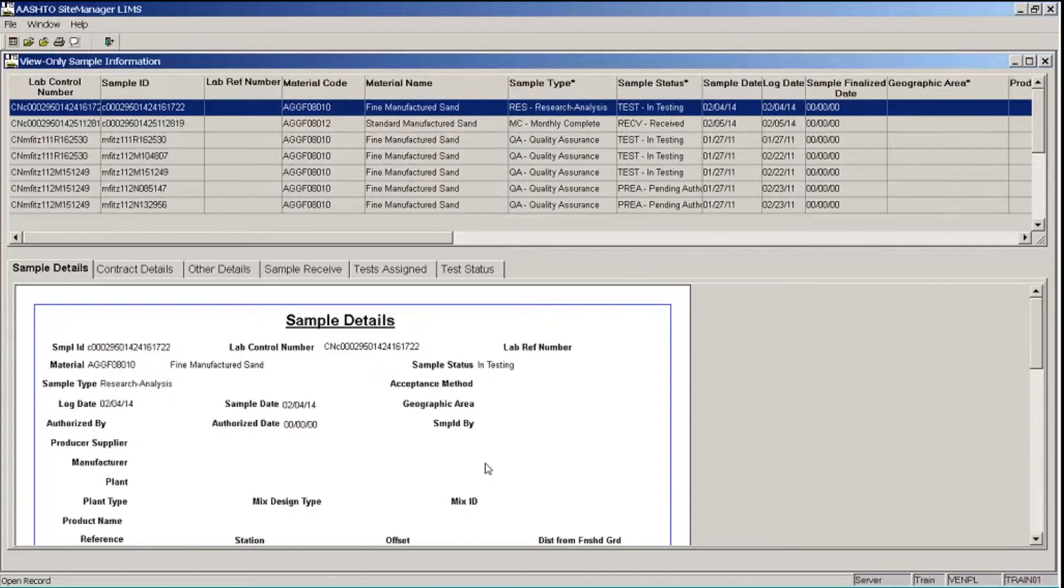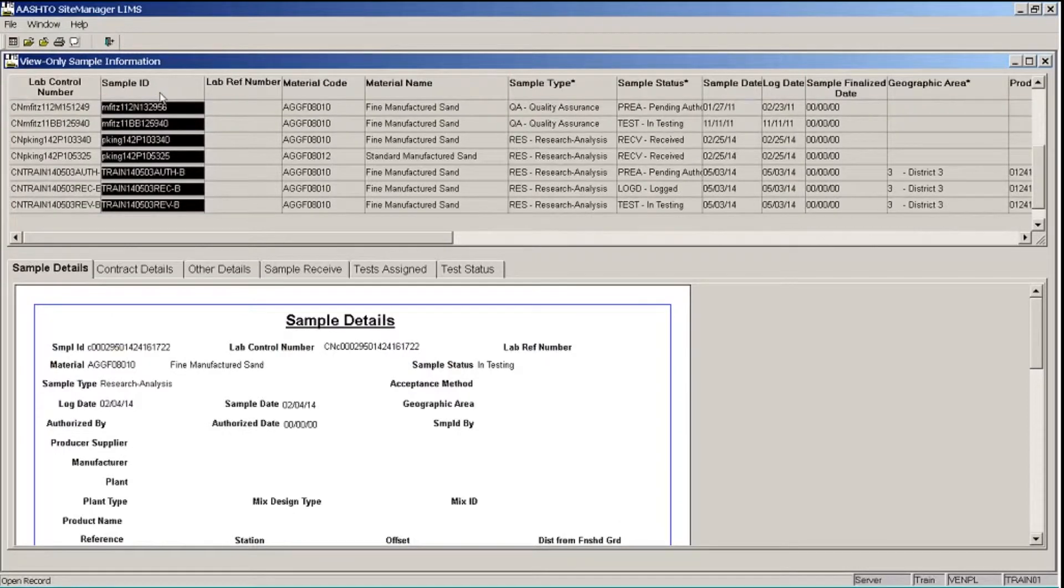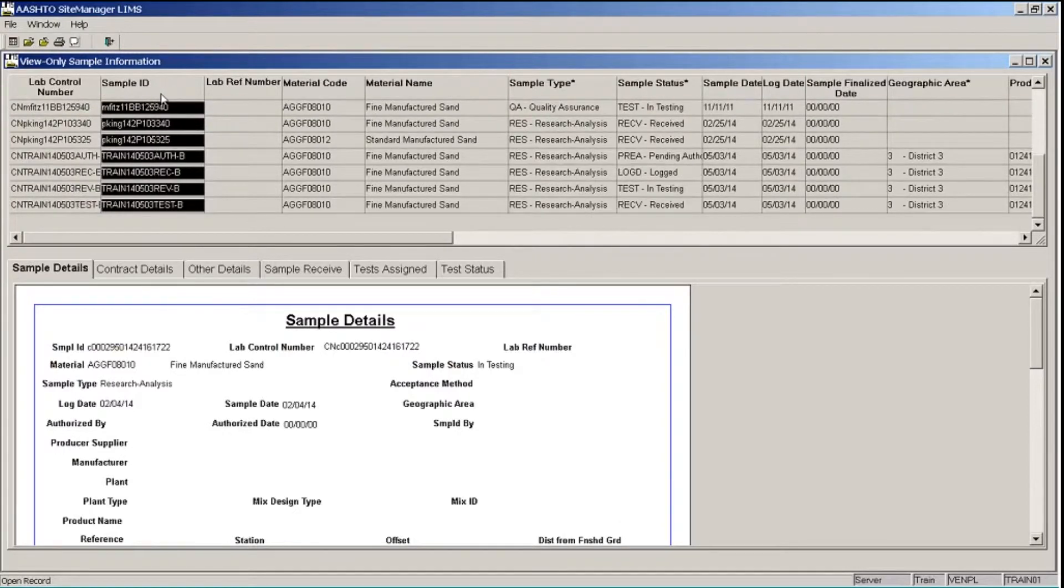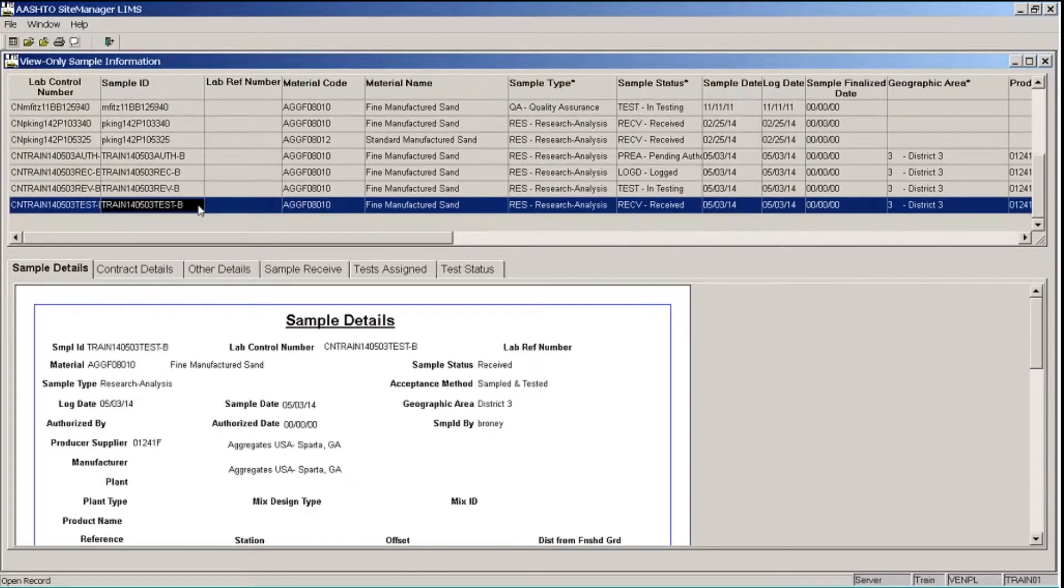So I want to search for a particular sample record. I'm going to sort the list by sample ID. And then scroll down to find the sample ID that begins with TRAIN and ends with TEST-B. I'll highlight that row. And so now in the bottom pane, it's going to show the sample information for the selected sample.